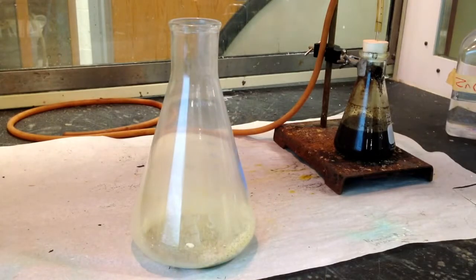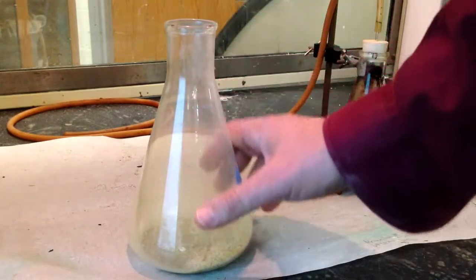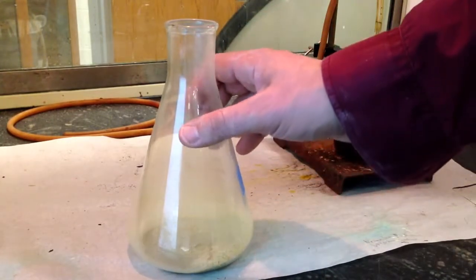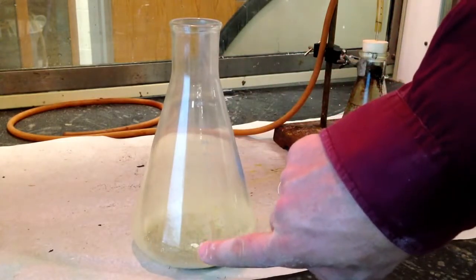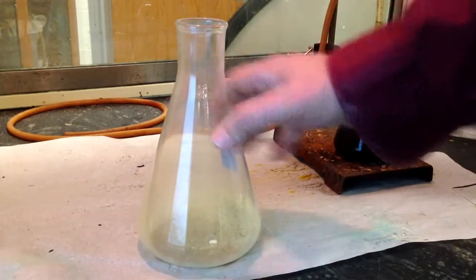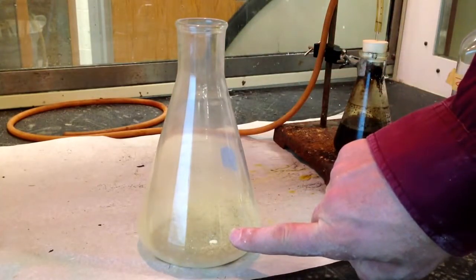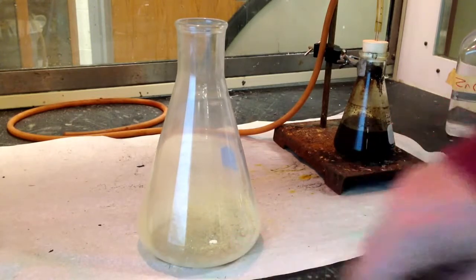So once the dust has settled, so to speak, we're left with an Erlenmeyer flask that's kind of milky white on the outside. That's where the sodium chloride dust has settled. But if you look very carefully, you'll see a white spot. That white spot, and I'll get a close-up in a second, represents where the sodium was in highest concentration. And that is where you see some solid sodium chloride crystals.